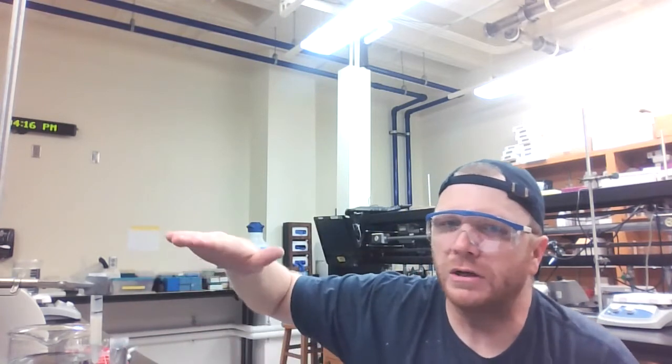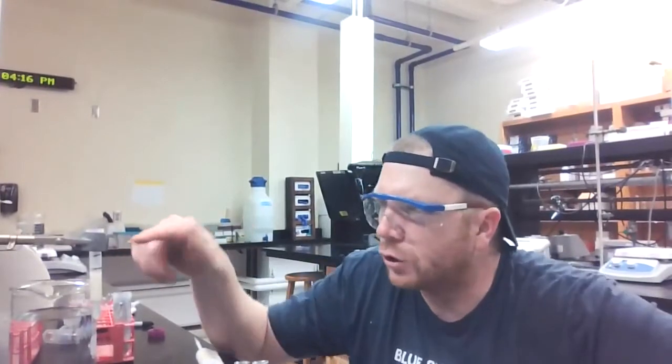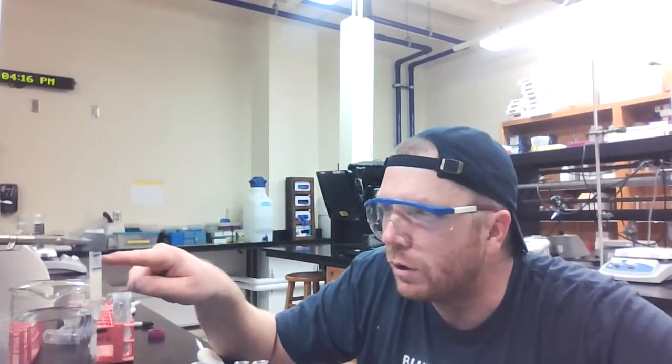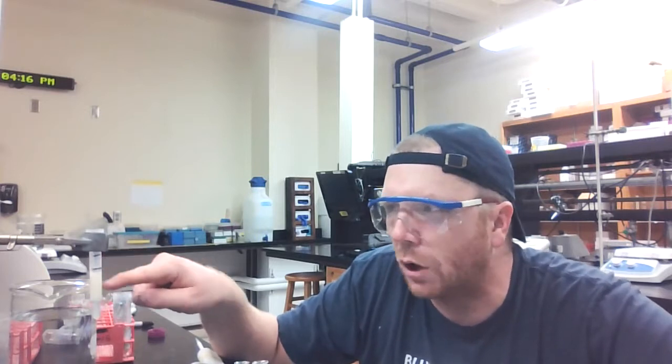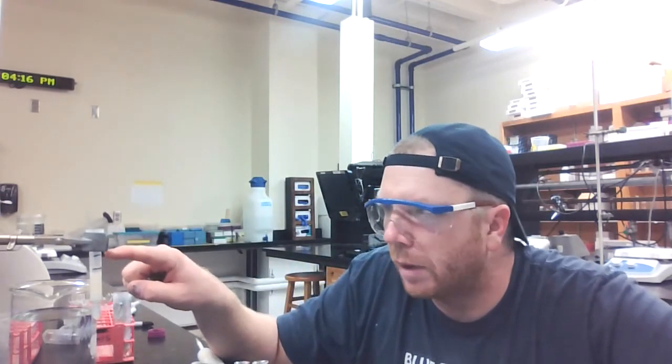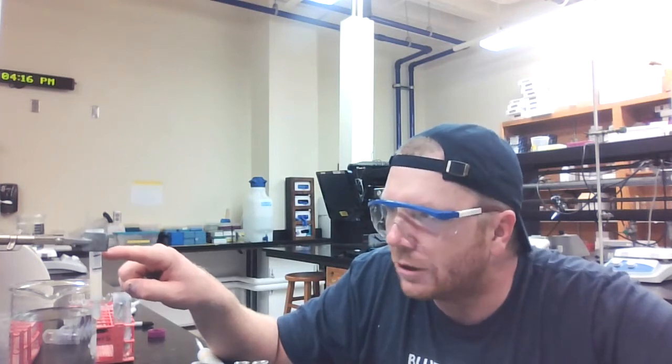So think about that elution buffer. It doesn't necessarily have a pigment or anything like that, but just imagine whenever you add it up here, well, sure, it's going to diffuse through, but do you think it will diffuse all the way to the bottom of the column like that? I wouldn't expect it to. So it's going to be a gradual process. Essentially, my elution buffer is added. It's largely going to stay at the top half of the column.